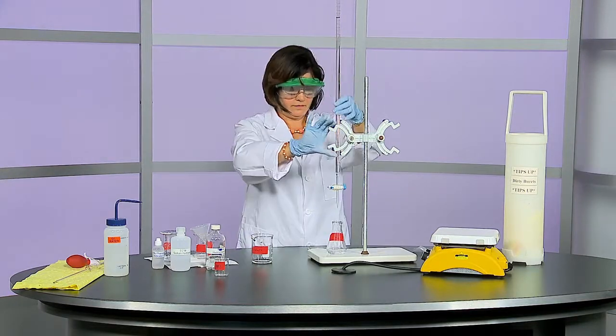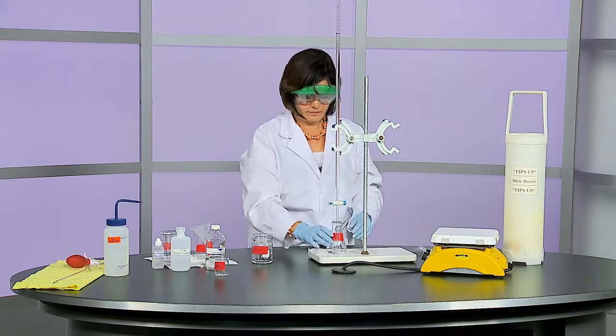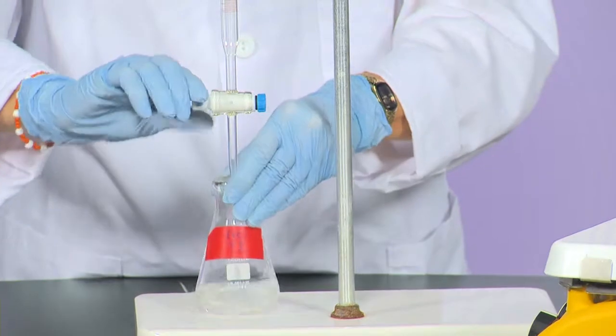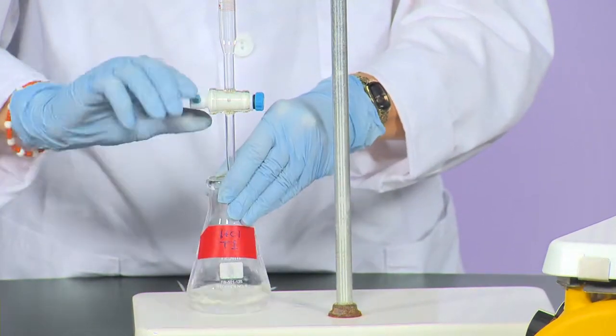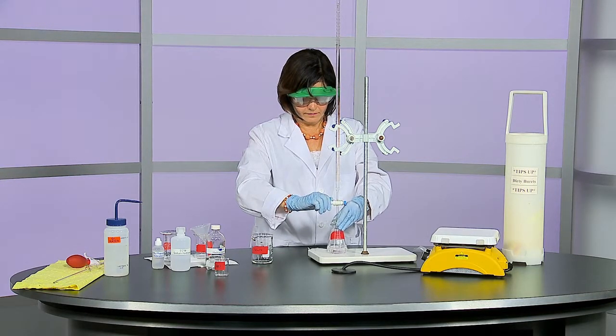Make sure the tip of the burette is slightly below the top of the flask. Open the valve and allow sodium hydroxide to pour into the Erlenmeyer flask. You might want to add slowly with the first titration so you do not pass the end point. Once you have titrated the first sample and have an idea of the volume needed, you can titrate the second sample more quickly. Sometimes it is helpful to do a rough titration.